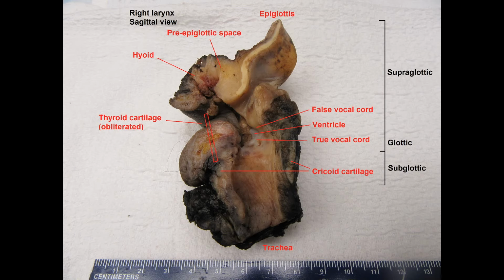So, final question for me: How important is it to sample the uninvolved larynx, either as part of a tumor section or independently?